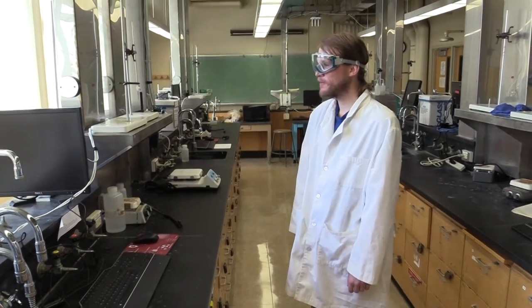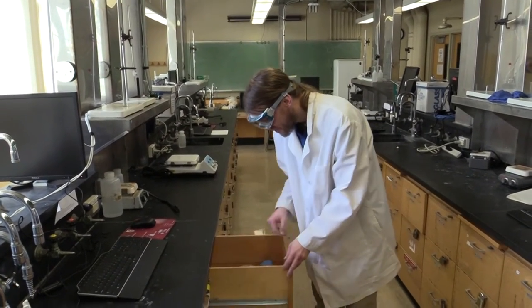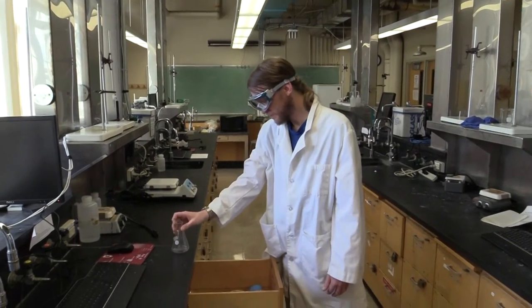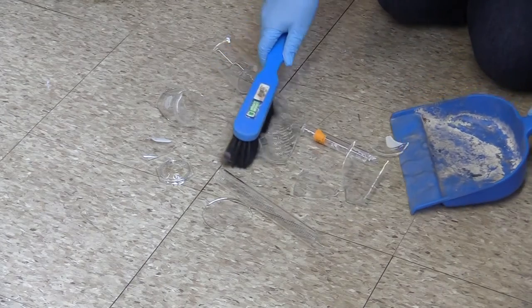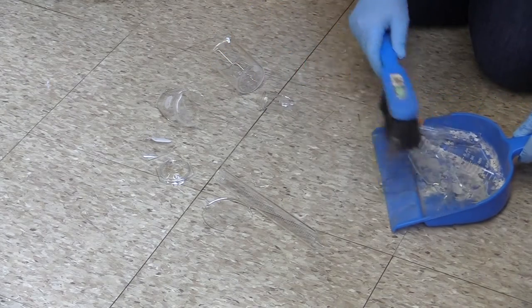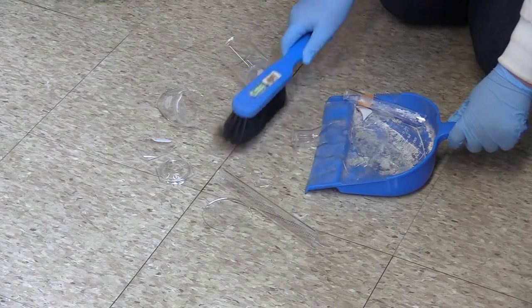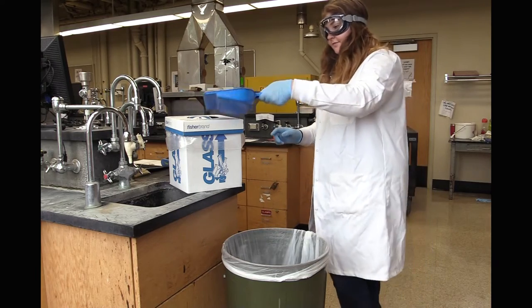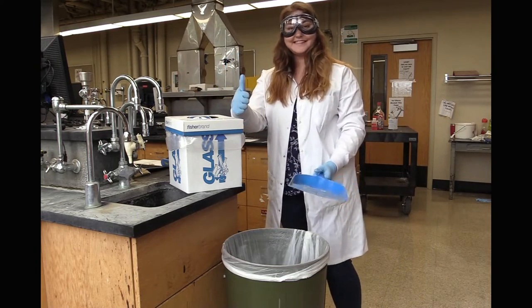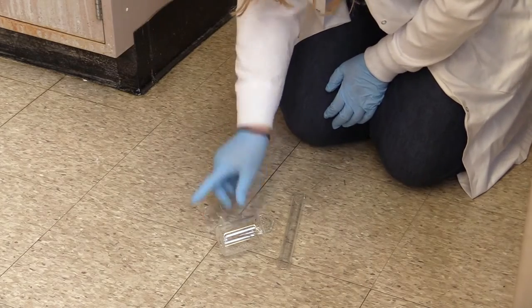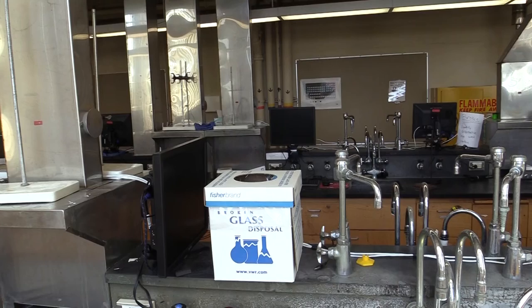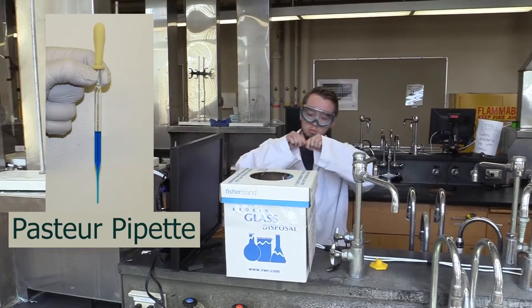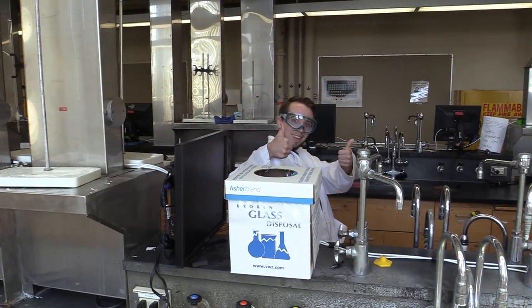Now it's time to talk about equipment. Before you use your glassware, give each piece a quick check to make sure it doesn't have any cracks or nicks taken out of it. If one of them does, there's a good chance it will break right when you least suspect it. If you do break a piece of glassware, make sure to tell the people around you first so they can watch out while you get your TA's attention. Sweep up the pieces with a dustpan and put them in the glass waste containers, never in the trash. Don't pick up the pieces with your fingers. These waste containers are also where you'll discard your disposable Pasteur pipettes, even if they're not broken.